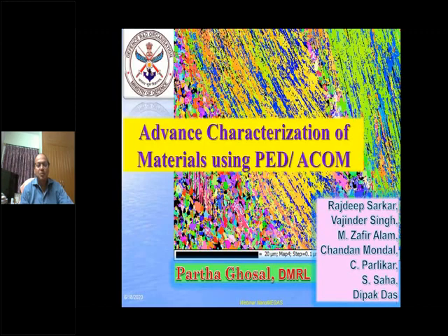So I'm very happy to share with you some of the important results of what we intend to do in our laboratory. My topic for the day is advanced characterization of materials, using PED and ACOM.